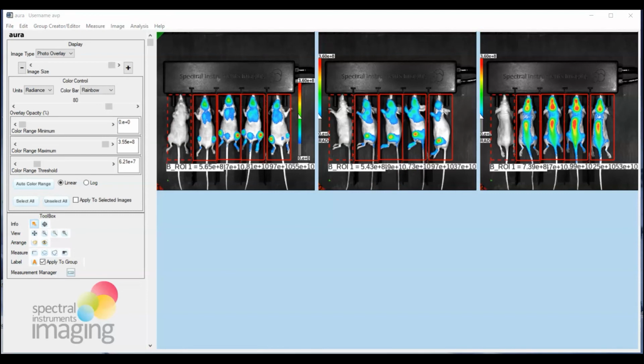Now we're going to go ahead and save these newly drawn or applied ROI templates to their respective AMI files. The advantage here is that when you reopen the AMI file, you won't have to redraw any individual ROIs or apply sets of ROI templates. The ROIs will already be there, and you'll have the opportunity to either confirm, modify, or add to the ROI analysis done. All right, so how does one do this?